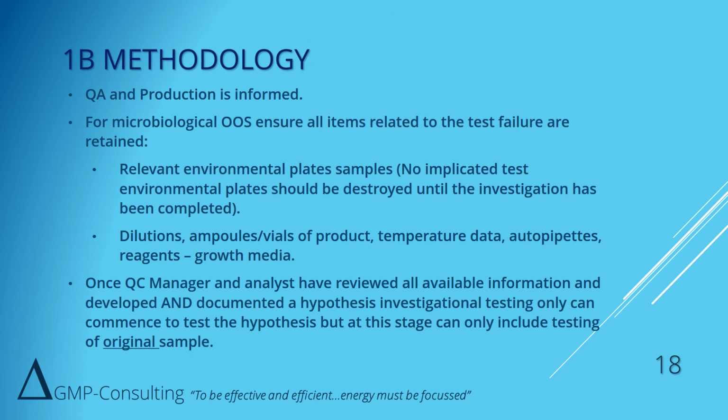This slide reiterates what I said on the previous one, but briefly mentions microbiology and not throwing samples out. And at this stage, once the QC results have been reviewed, and you're at 1B and you have got a hypothesis test to carry out, at this stage you can still only do these tests on the original sample or preparations of the original sample. It's ideal if you've got the original volumetric flask, for example, but if you've got the original bottle of powder or tablets or vials, so much the better. It's not time yet to go out in the factory resampling yet.